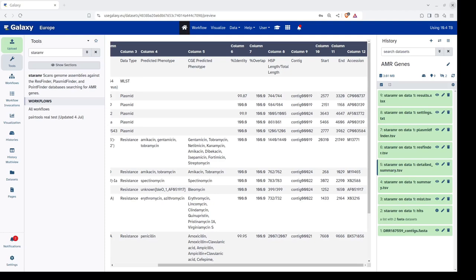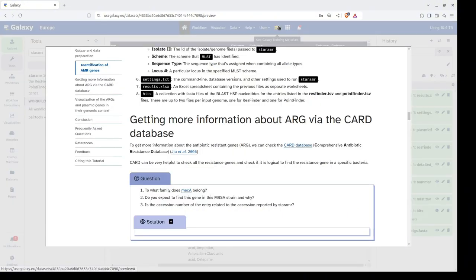Similarly, we can look at results reported individually by ResFinder and PlasmidFinder along with MLST information in their respective TSV files. The HITS file is a collection of FASTA files of the BLAST HSP nucleotides for entries listed in resfinder.tsv and pointfinder.tsv. This completes the first part of the tutorial for identification of AMR genes using the StarAMR tool. We can also retrieve more information about detected antibiotic resistant genes by checking the CARD database, which can help verify whether it is logical to find a particular resistant gene in a specific bacterium.